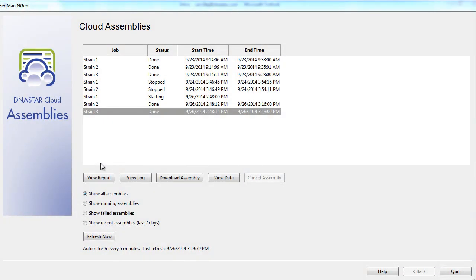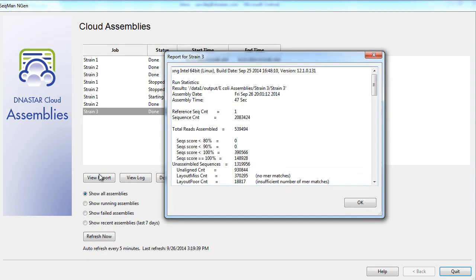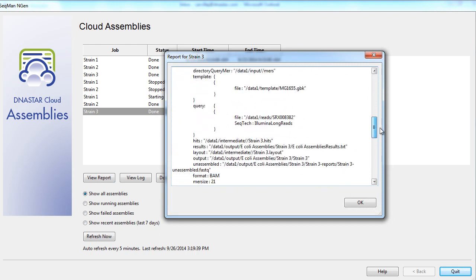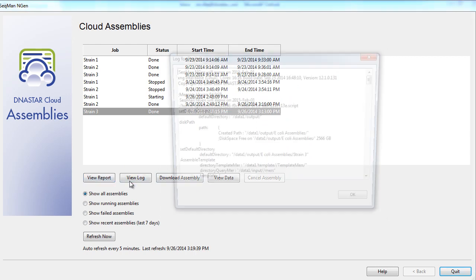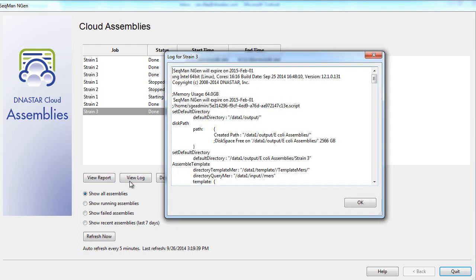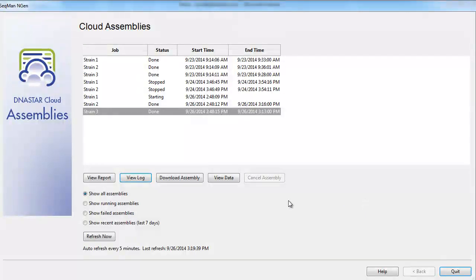Once our assemblies are complete, we can choose to view our assembly report, view the assembly log, or download our completed assembly projects to our desktop for further analysis.